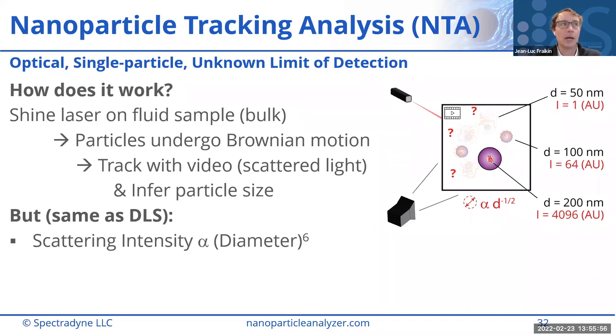In principle, I don't see why you couldn't monitor the concentration over time. And our technology allows you to run a single cartridge for, I think our longest measurements are something like an hour. So that's not very common, but it can be done. So certainly over the time span of a few minutes, you could monitor a change in concentration versus size over time and sort of segment the analysis that way. Does that answer your question?